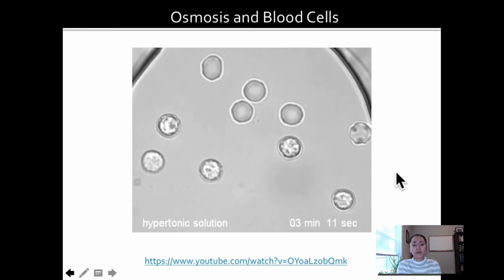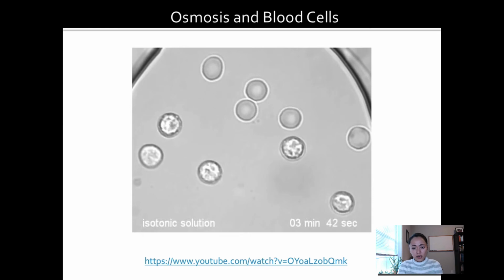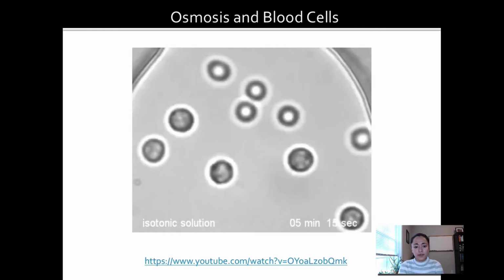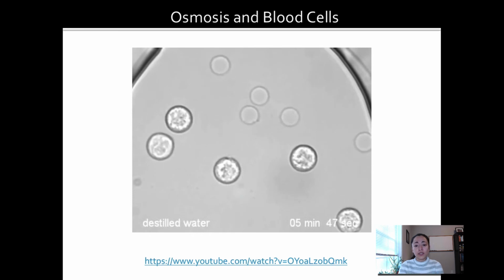So here they're being placed in a hypertonic solution, so they're starting to shrivel up. The effects aren't really obvious in that case. Now they're placed in an isotonic solution, and now they're being placed in distilled water. Distilled water is hypotonic. There are no solutes in there.